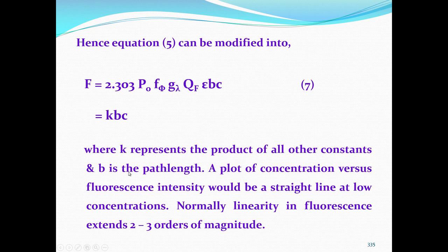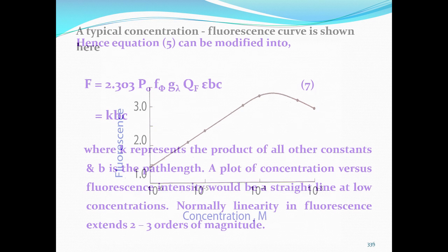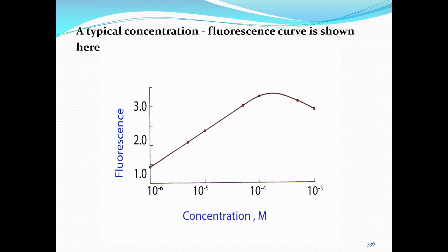So, in absorbance, when I make a calibration curve like this, I get a linear relationship between 1 ppm, 2 ppm, 3 ppm, 5 ppm, but of the same order, maybe one order more, 1 ppm, 10 ppm, then above 10 ppm Beer-Lambert's law will not hold good.